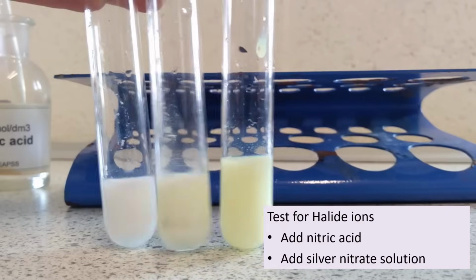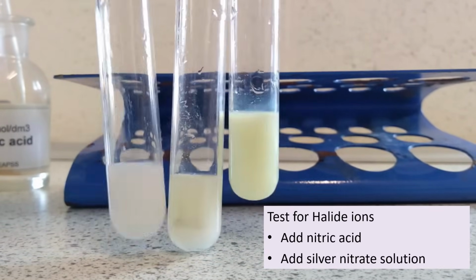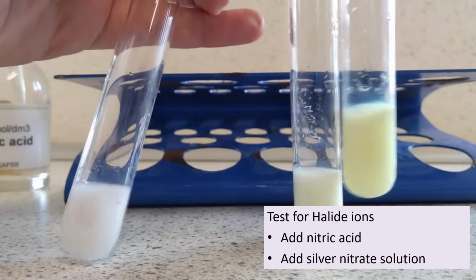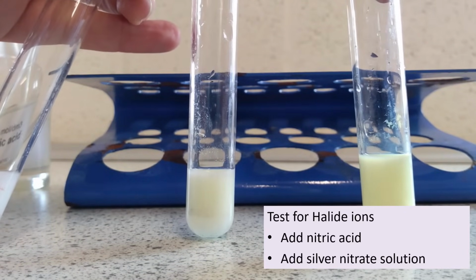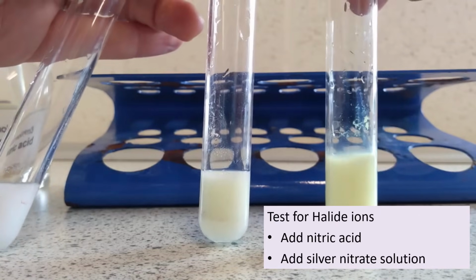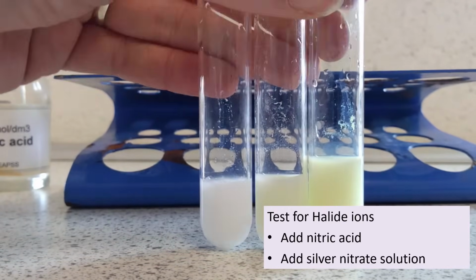And here they are in order. So the first tube contains sodium chloride, or did contain sodium chloride, and it now has a white silver chloride precipitate. And then my second tube with the cream precipitate, that one is containing bromide ions, so this is a silver bromide precipitate. And finally I've got my iodide ions, so you can see as we go white and then cream and then sort of a pale yellow.